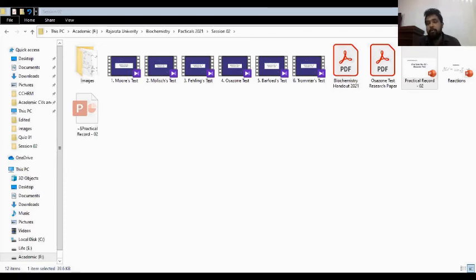It's not a melting point. We can assure that there is 100 degrees Celsius when we use a boiling water bath. Okay, and we have to maintain 4.3 pH. Usually, when we use this sodium acetate and acetic acid buffer, we can say that we have that pH.